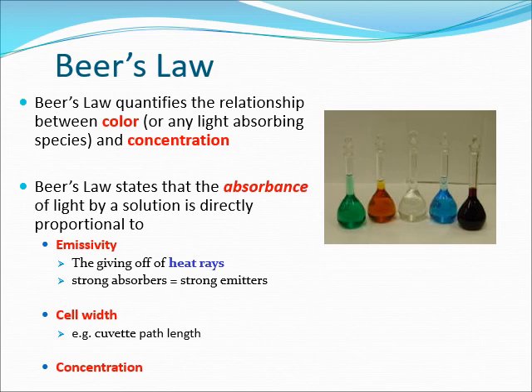And then after set the wavelength, dan juga blank dah diletak dalam machine, you kena calibrate lah. So dia akan zero kan dia punya machine, and then you keluarkan blank. Lepas tu, lepas you dah zero kan dia punya bacaan, optical density tu akan 0, and then you masukkan you punya sample pula, barulah you read the bacaan of you punya sample. So optical density will come out from the machine, specific for your samples at the specific wavelength. So that is how you use the spectrophotometer.